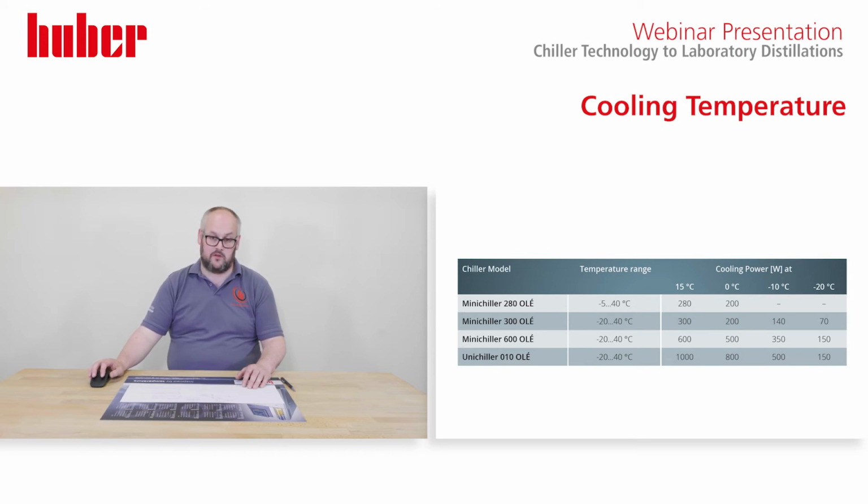So one of the key factors here is how volatile are the solvents and the chemicals you're trying to distill. If you work in the flavorings or aroma industry, you might want to set it at -10, because you know that you'll catch those low boilers there. But for most people, running between 15 and 10 degrees C is fine. A couple of reasons for this.